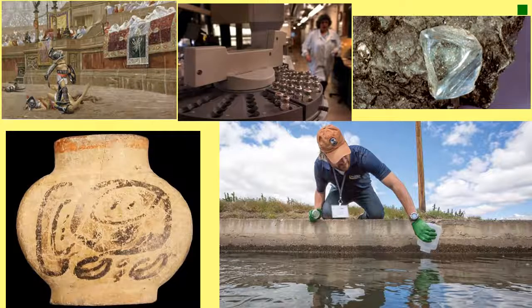And lastly, let's have a look at this 2,000-year-old Mayan pot. Interestingly, what scientists were able to do with this pot is examine what it was used for. And this pot from 2,000 years ago is probably the earliest known use of cocoa for chocolate. And it was also established that the chocolate contained other ingredients like chili. So there's a few uses of mass spectrometry.